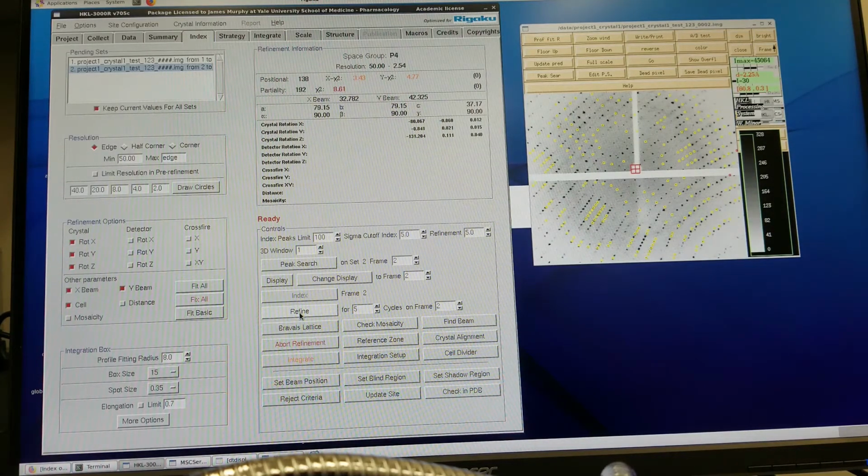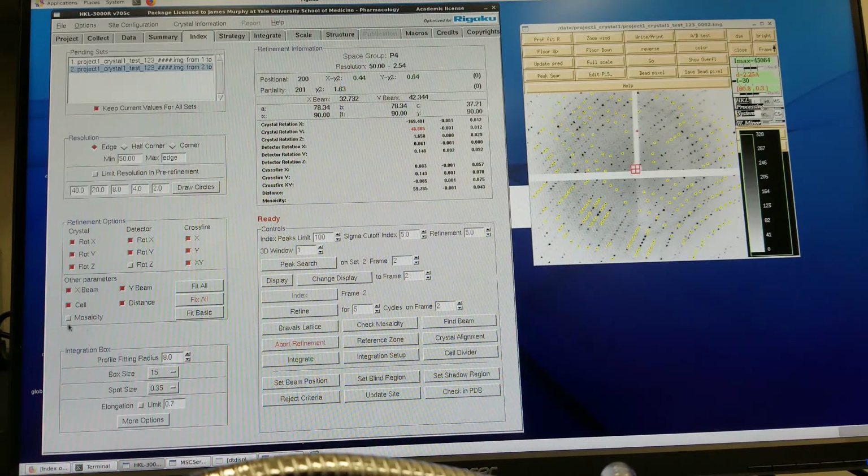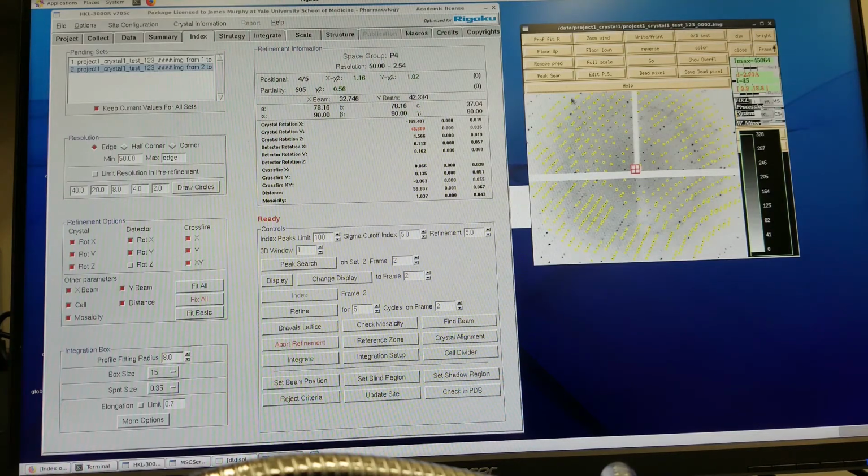So I'll refine it a couple times. Okay, so what we're looking at now is the yellow spots are where the predictions of the spots are based on this unit cell. And they match up with where the spots really are. So, cell is indexed. We know it's a P4 space group class. And we know the dimensions of the unit cell, A, B, C, and the three angles, alpha, beta, gamma, and 90.